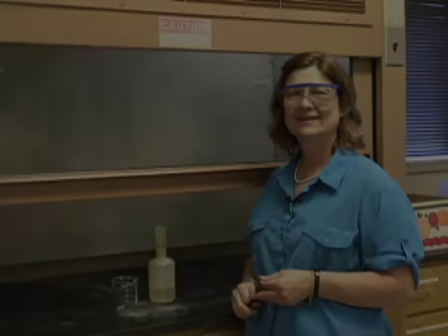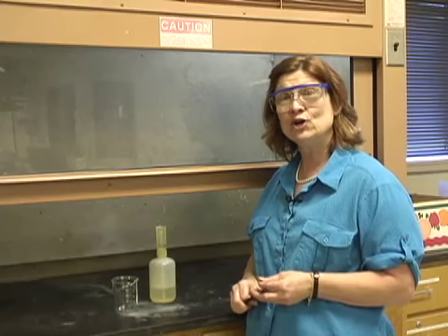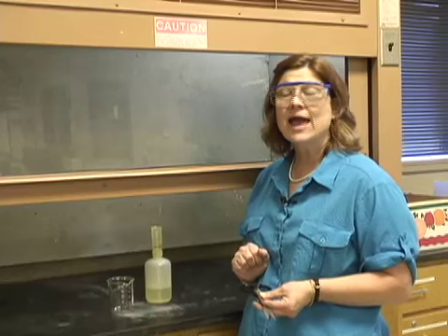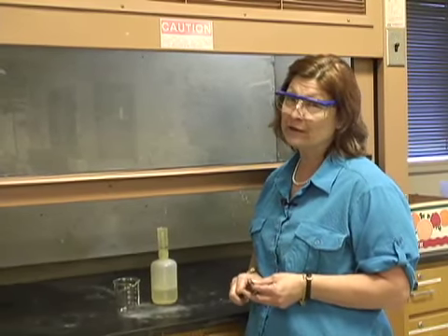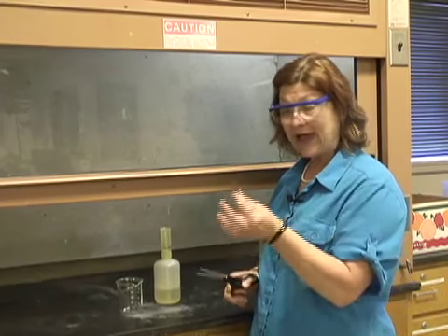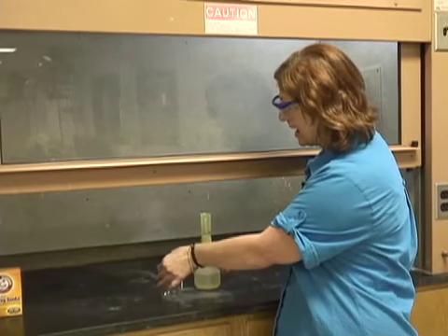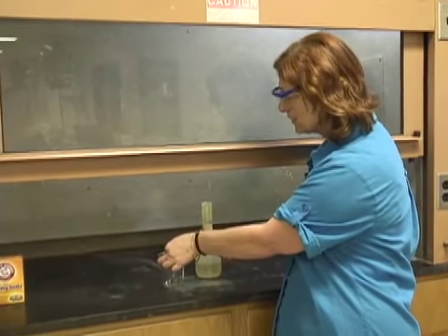I will see you at the hood. Here we are at the hood. What the hood does is it sucks all the air out, and we have used this before in the lab. It's very, very important in this portion of the lab. I have my piece of copper, and because I'm always in a hurry, I'm going to cut it into smaller pieces so that it reacts more quickly.